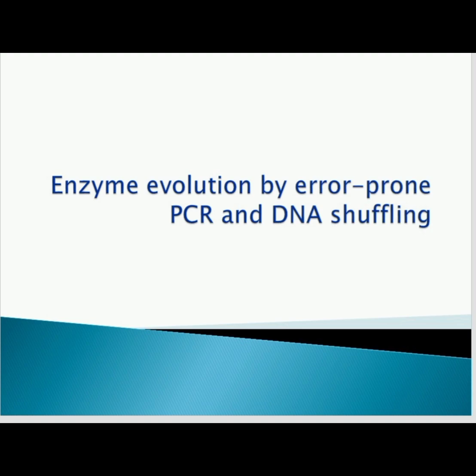It modifies standard PCR conditions to increase the error rate of DNA polymerase to generate diverse mutant libraries for screening. It is used to create a library of gene variants with random mutations to study protein function, improving enzyme activity, or exploring evolutionary pathways. This technique can be used in protein engineering, enzyme optimization, synthetic biology, and functional genomics.